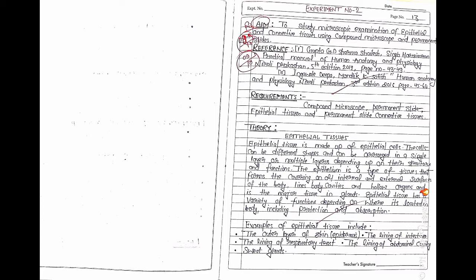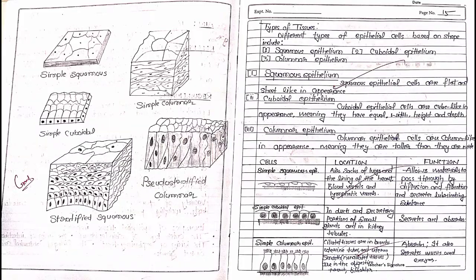After that we see the theory. In this theory we describe the epithelial tissue, compound microscope, connective tissue, and permanent slides and where they are used. Then we see the types of tissue.